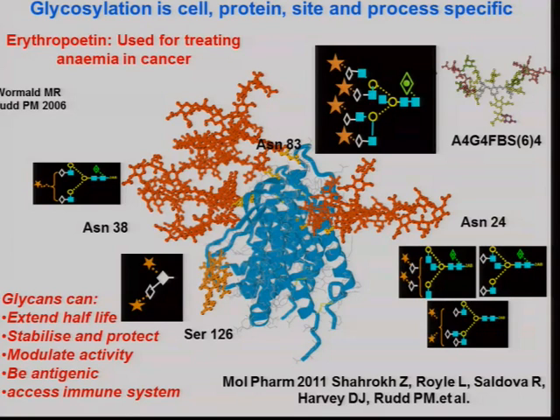So that's why you get not so much G2, and you get G1 distributed on both arms, and you get G0. Now, those proportions are different if you have rheumatoid arthritis: you have a lot of G0, and you have some G1 and some G2. But a lot of diseases and a lot of bioprocesses actually favour one particular glycan, partly because of the accessibility problem, but also because of the levels of the galactosyltransferase.